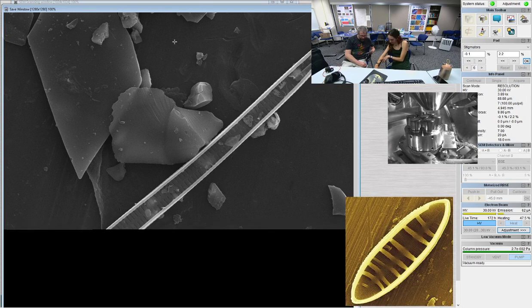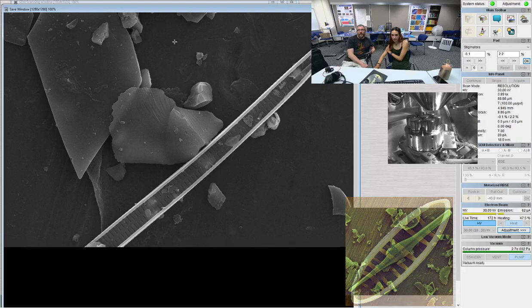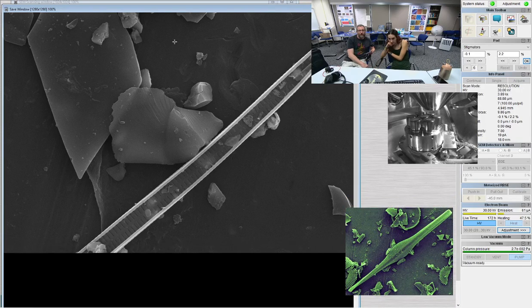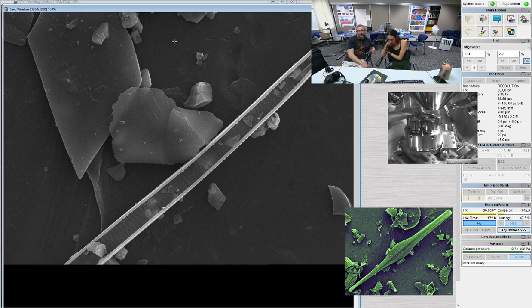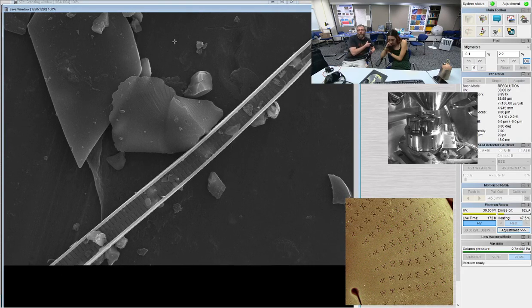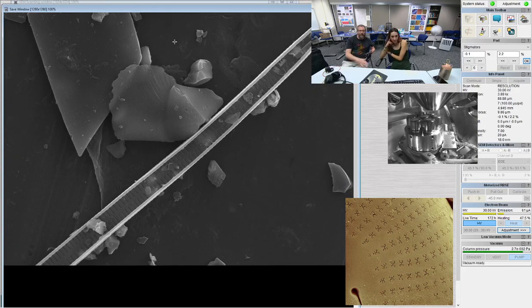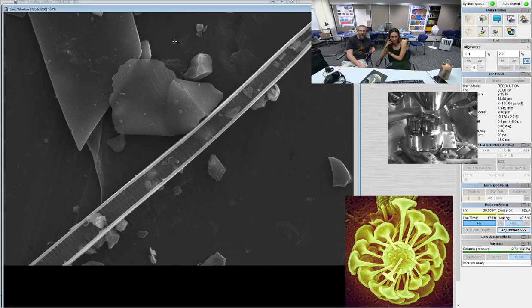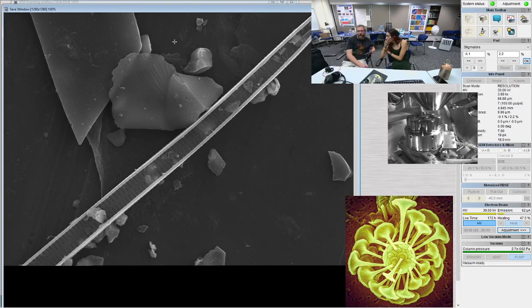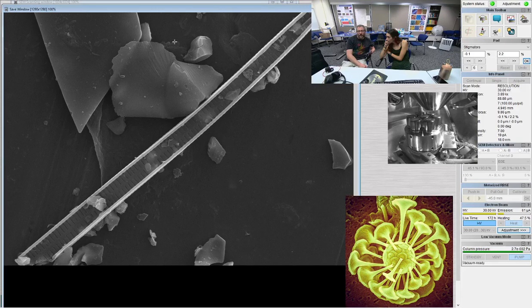It takes some time to learn. We had an electron microscope lab in class in college on theory and practice. It was one of my top three favorite classes. I taught a class on how to use this SEM two falls ago, as a graduate and undergraduate level class. The students only did 3 or 4 lectures, and the rest was all practical microscope time, where everybody sat here and got hands-on experience learning how to focus and how to use the stigmation.